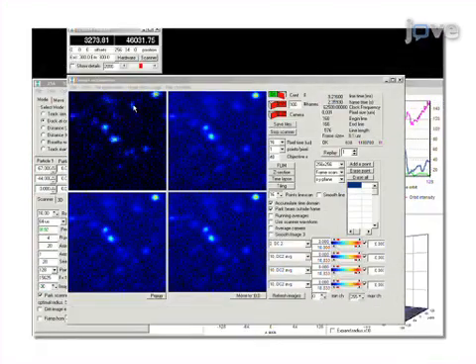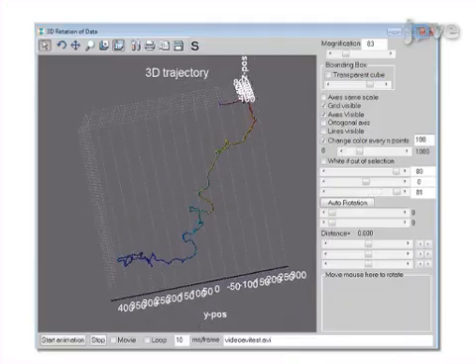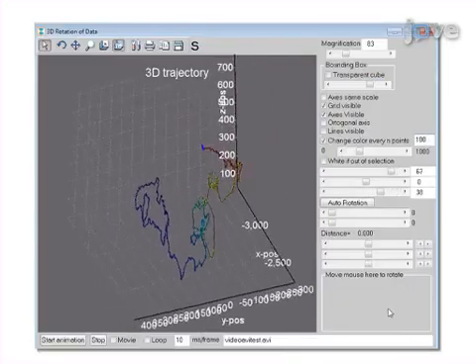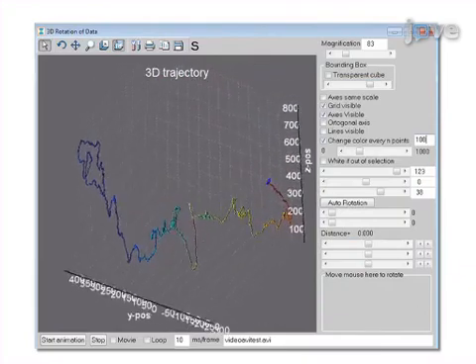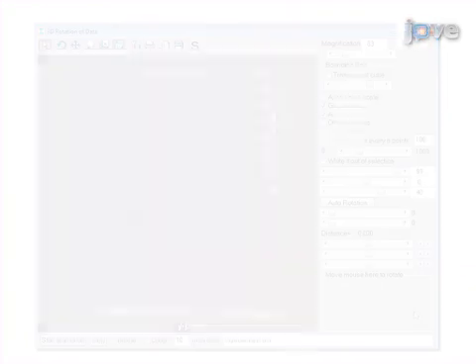Ultimately, the results show that it is possible to follow fast-moving lysosomes in 3 dimensions and to detect interactions with other fluorescently stained organelles encountered along the laser orbit during the tracking.